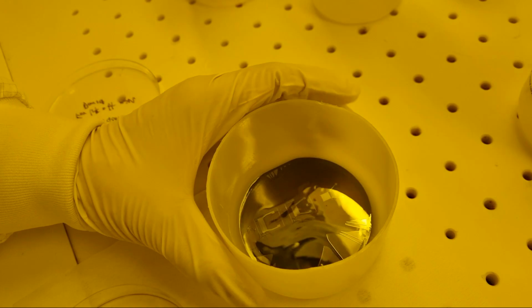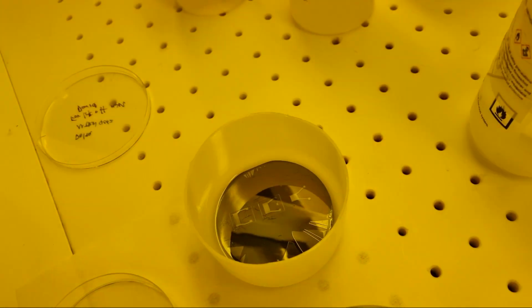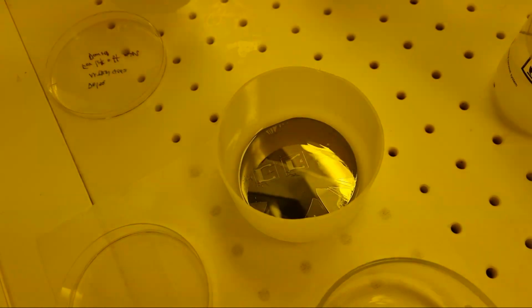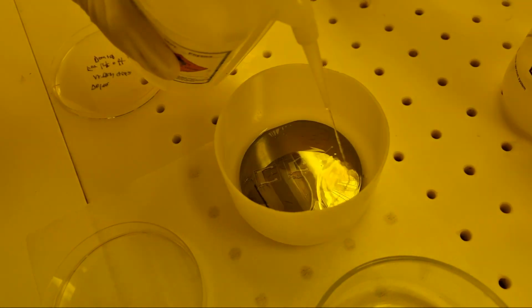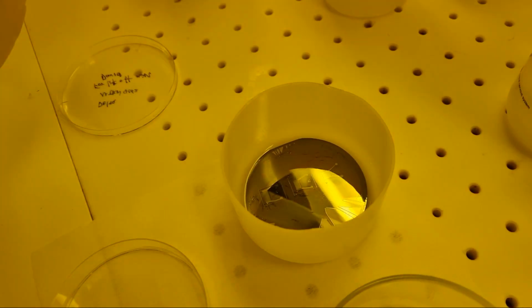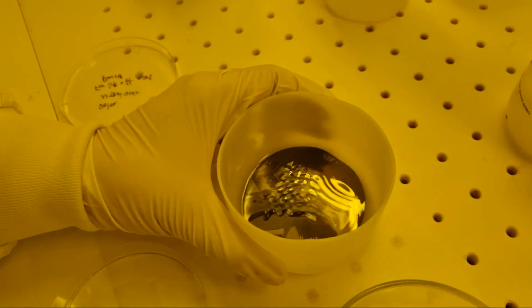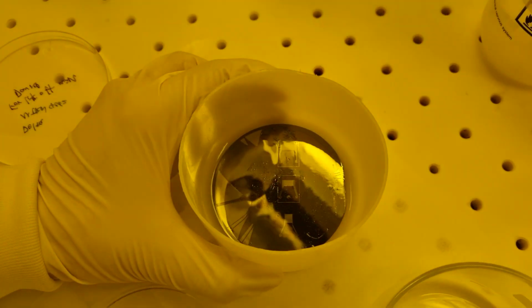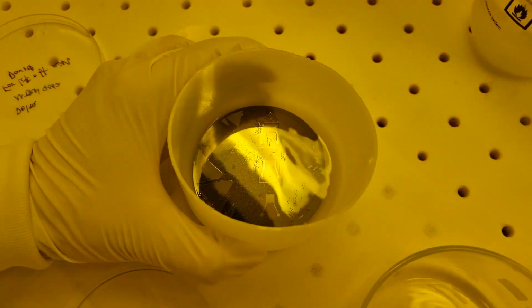Depending on the thickness and condition of the resist and the thickness of metal, it could take a minute or much longer to fully clear the photoresist and the metal above it. The metal does not dissolve in the solvent and presents a barrier that keeps the acetone away from the photoresist. If the metal is very thick or has made a conformal coating over the resist edges, it could take a very long time. Negative tone resists can produce negative sidewalls to facilitate the liftoff process.